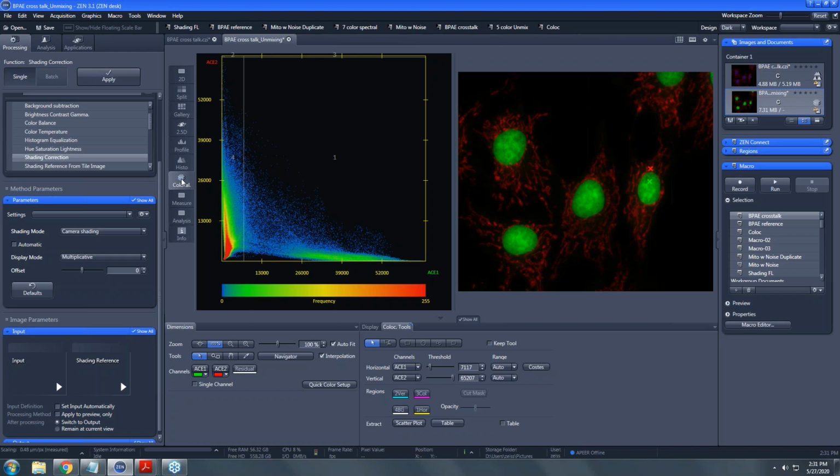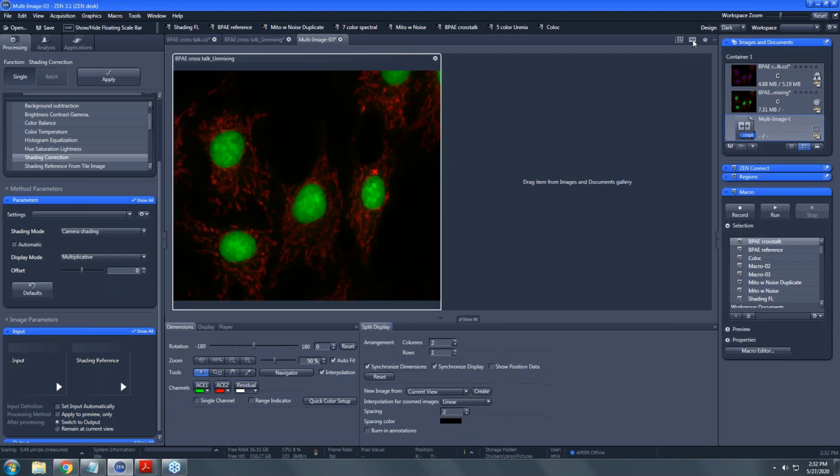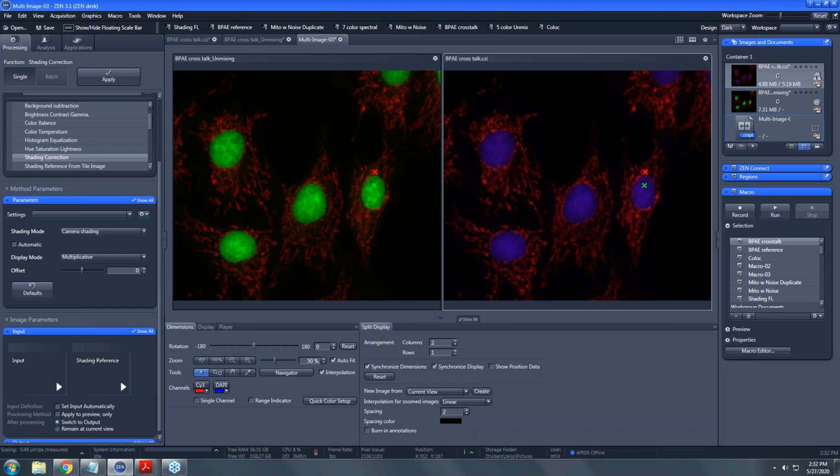Chantal, do you think we can put these up side by side just as a regular 2D, and we'll toggle off the DAPI channel and we can see how it's bled through in the one and not in the other? Can I do this here? Yeah. And just drag the other one in and then toggle off the first channel.